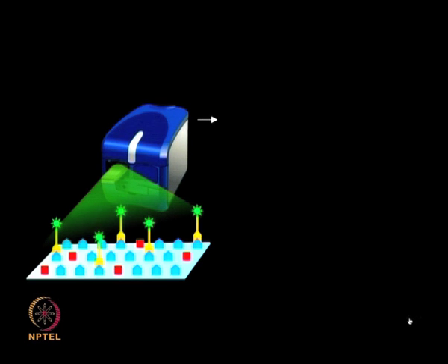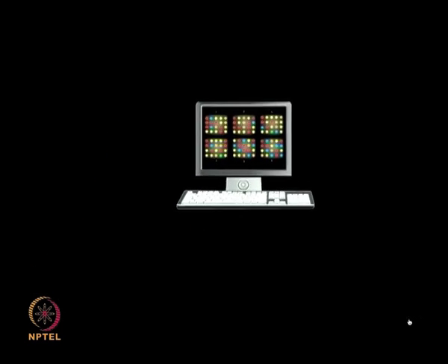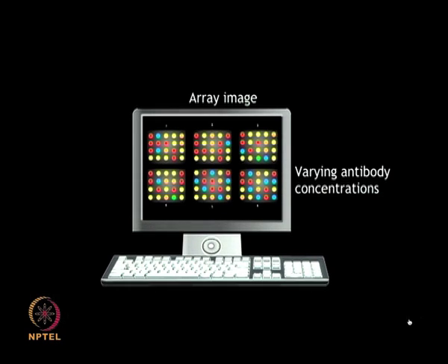It was found that these antigen arrays allowed detection and quantitation of antibodies down to absolute concentrations of 100 picogram per ml. These detection limits can further be improved by using high affinity and purity antibodies. Thereby, it demonstrated great promise for high throughput and sensitive clinical applications.